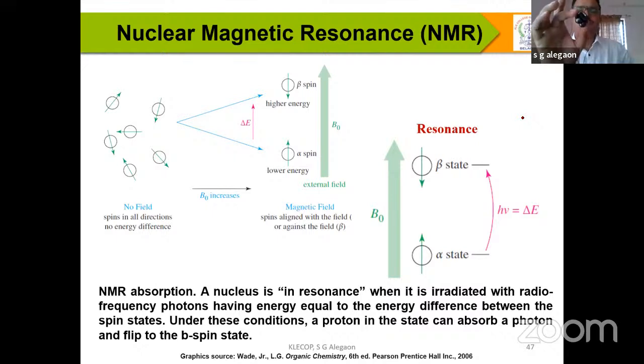Look at this. The proton also has electric charge and momentum. Any molecule having protons and neutrons has the very important characteristic of a magnet.